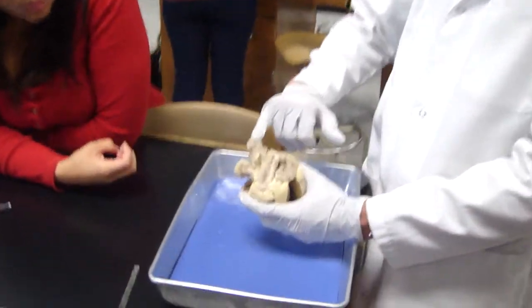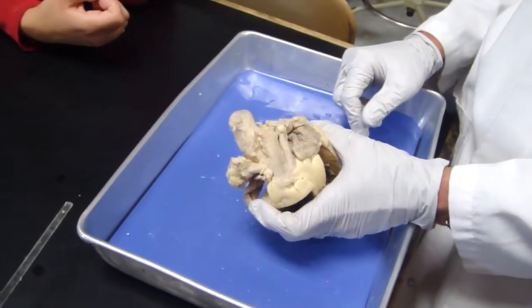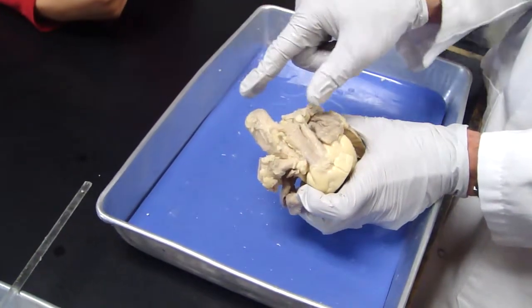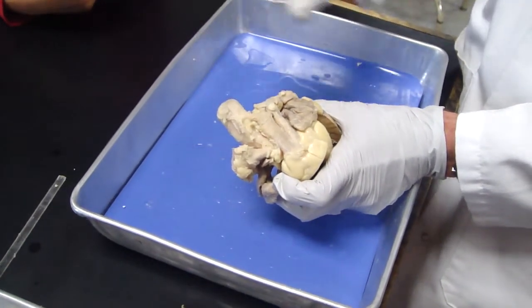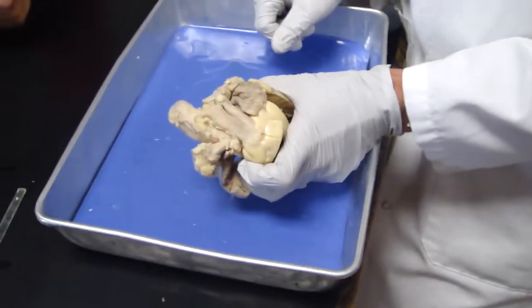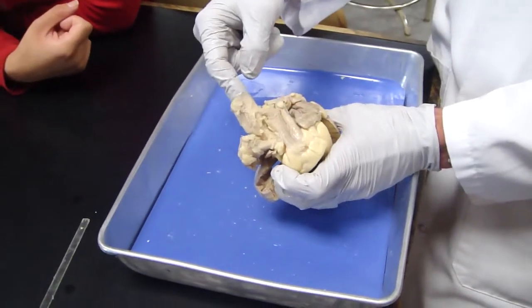Behind it is aorta. And aorta has the arch in it, right? But typically on these specimens, it's going to be cut off before it arches. So you can tell right here, it's just starting to arch. If we went another inch, you'd see left common carotid coming off of it. And if we went another inch after that, you'd see left subclavian coming off. Rarely do we have that much of the great vessels. So that would be the way you tell pulmonary trunk versus aorta.